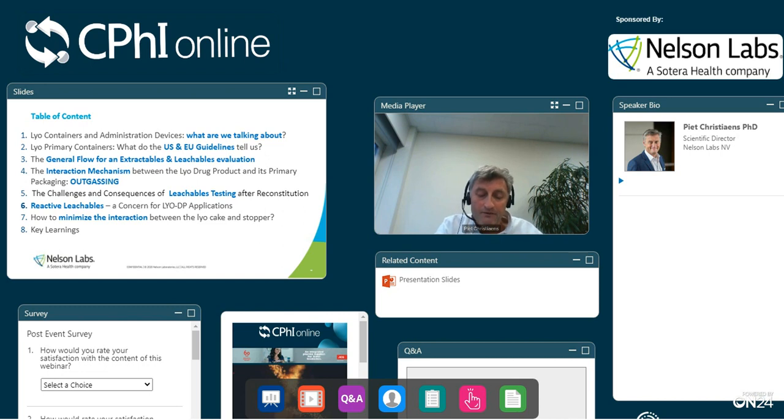In part 5, we will have a look at what kind of consequences that has in establishing or designing the leachable studies for lyophilized drug products. Part 6 will go a little bit deeper into the reactive leachables, something that we often see in these kinds of applications. And in the last part, we will have a look at how to minimize the interaction between a lyo cake and the stopper.